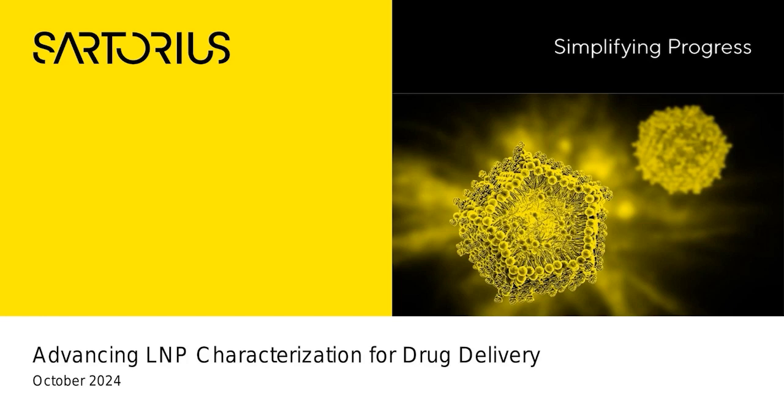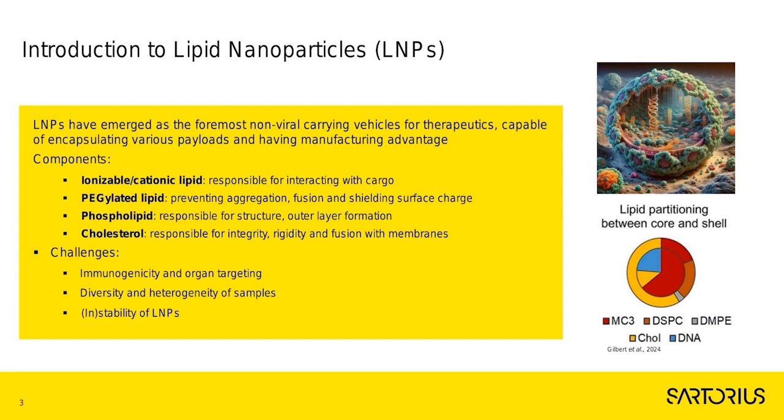Thank you, Roisin, and welcome back, everybody. So we've done pDNA, we've done mRNA. Now let's go into the final phases of the mRNA drug substance where it becomes a drug product. The most common way to do this is to encapsulate the mRNA into LNPs.